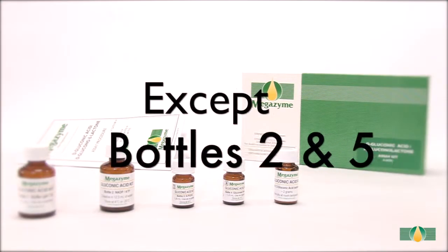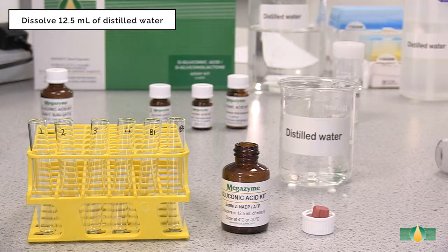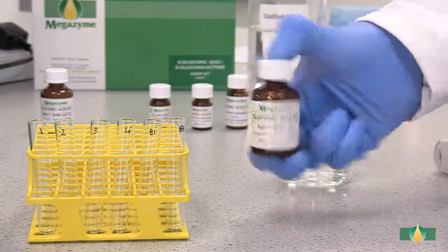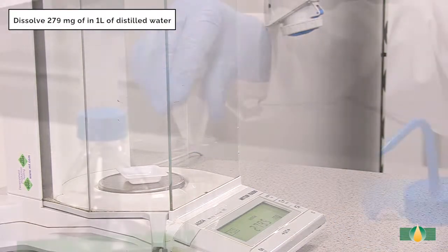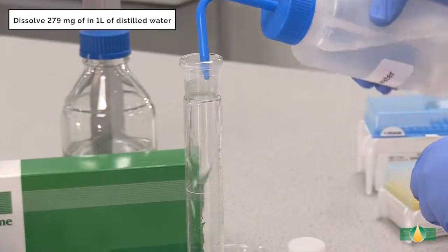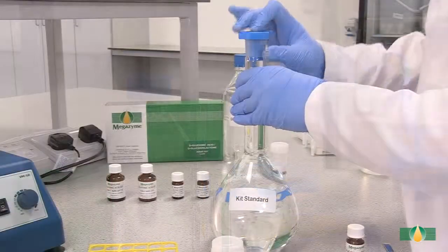All of the kit components except bottles 2 and 5 are used as supplied. The contents of bottle 2 are dissolved in 12.5 millilitres of distilled water. The bottle is capped and the contents are mixed thoroughly to ensure complete dissolution. To prepare the kit standard, bottle 5, accurately weigh 279 milligrams of its contents — sodium D-gluconate — into a 1 litre volumetric flask. Fill to the mark with distilled water and mix thoroughly.